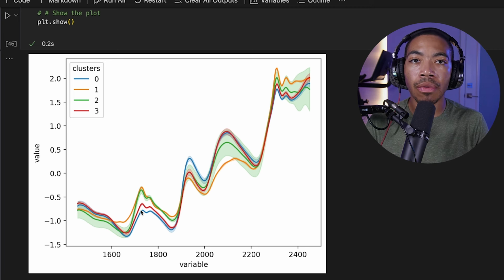So we're seeing where we have really reliable measurements, and thus the single most important wavelength is 1730 nanometers for this study. But you can imagine we don't have to take just one. We could extend this to the top 10, the top 50, even the top 100, and that might really help our models perform really well versus taking all the data. Of course, we can use PCA, and there are even other types of tests we can use to get at the same type of information.